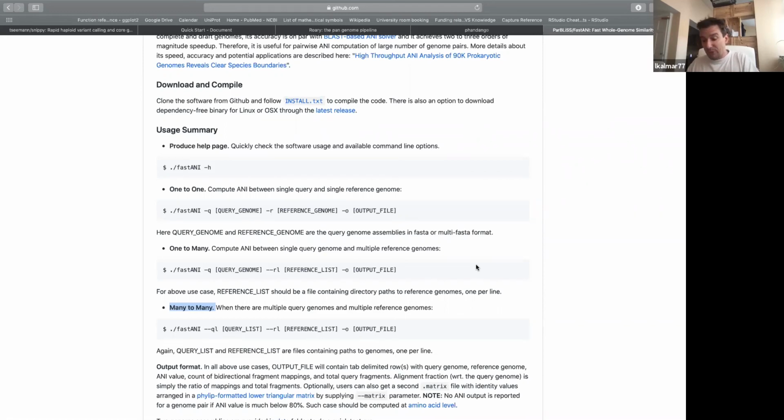So if you choose a k-mer-based method like FastANI or Mash, then very quickly you can find those metagenomic assemblies that are matching between two samples. And you can also see a kind of broad picture about the genus composition, for example, even if you don't have the exact match.